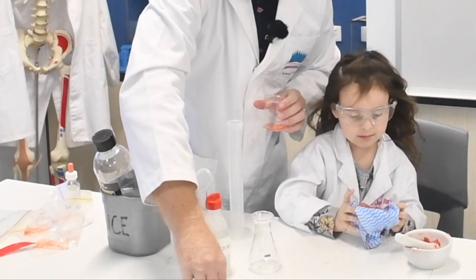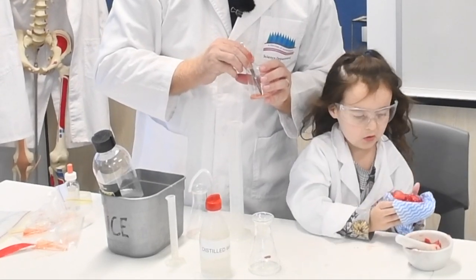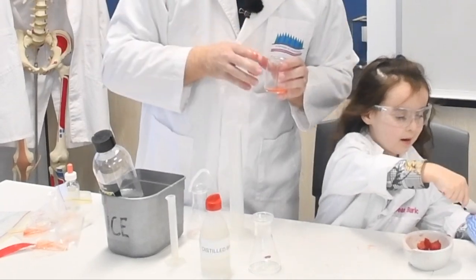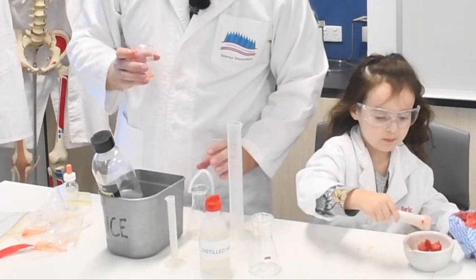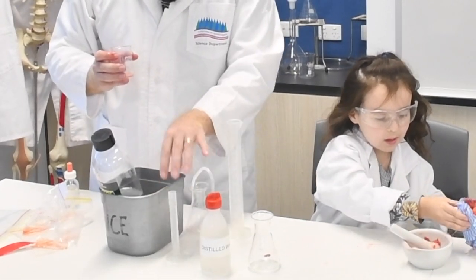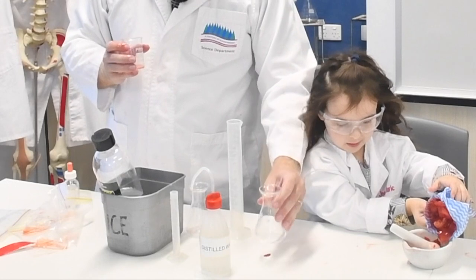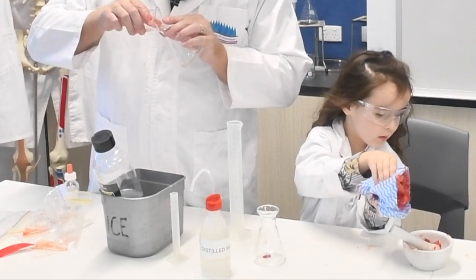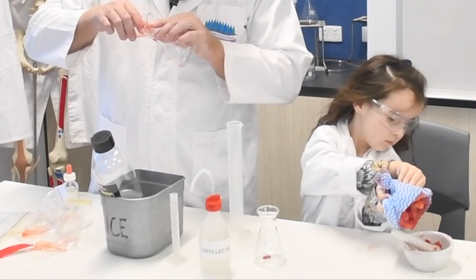Okay, a little bit of strawberry came through, so I'm just going to pick out that strawberry with my tweezers. Yay. Okay. Now what I'm going to do is pour it. I'm going to put the strawberries in there. Okay, you put the strawberries in there, and I'm going to pour the strawberry into here, just so I can try and get rid of some of that solid.